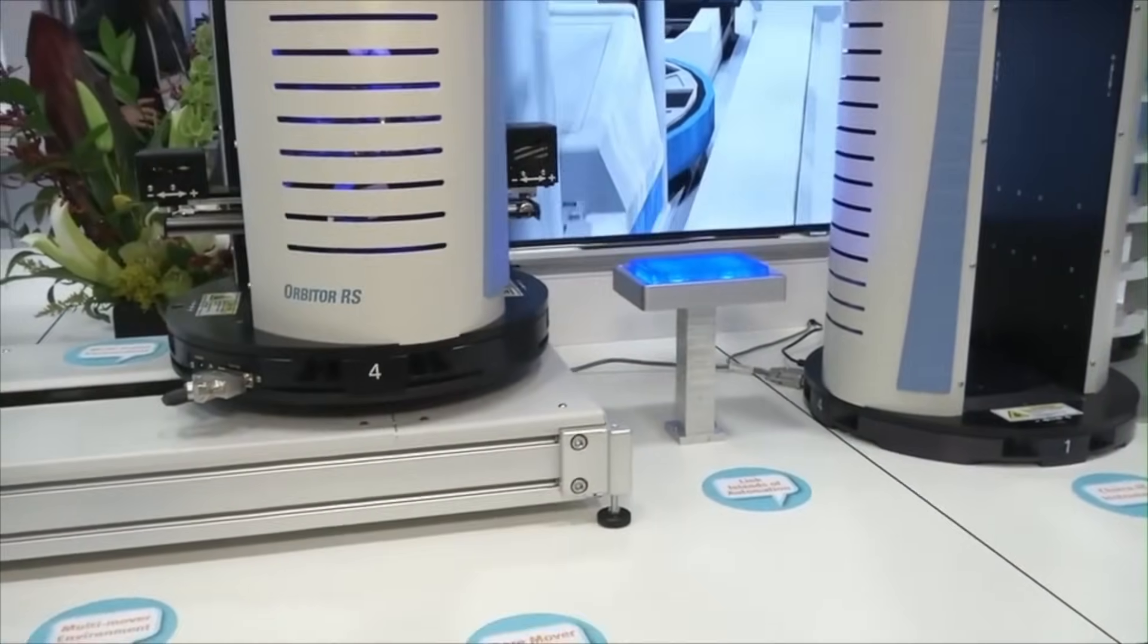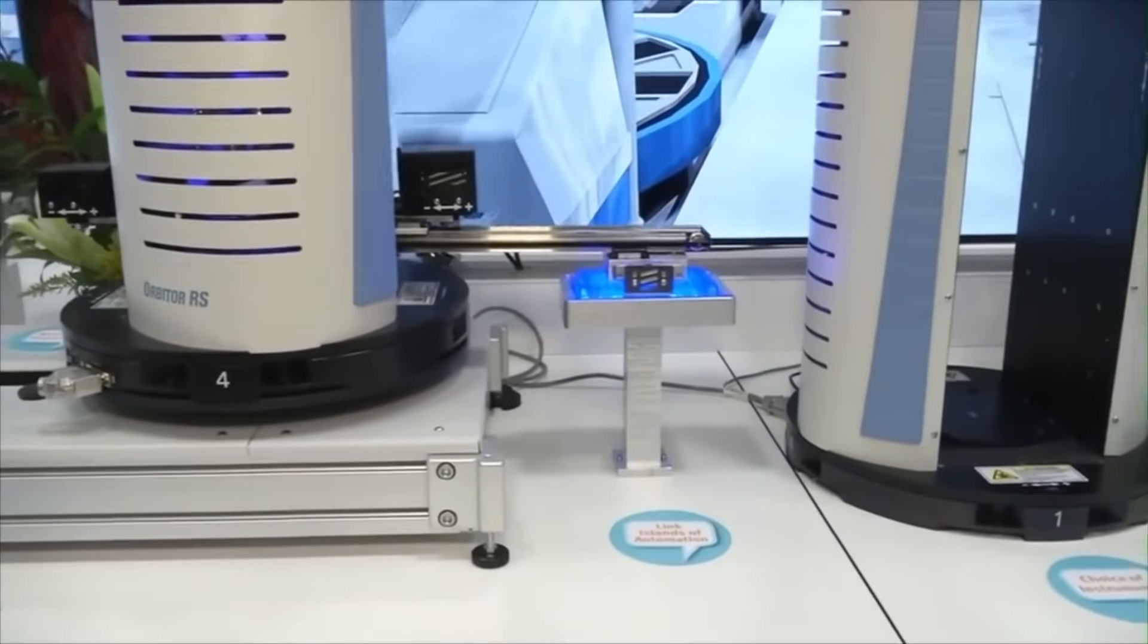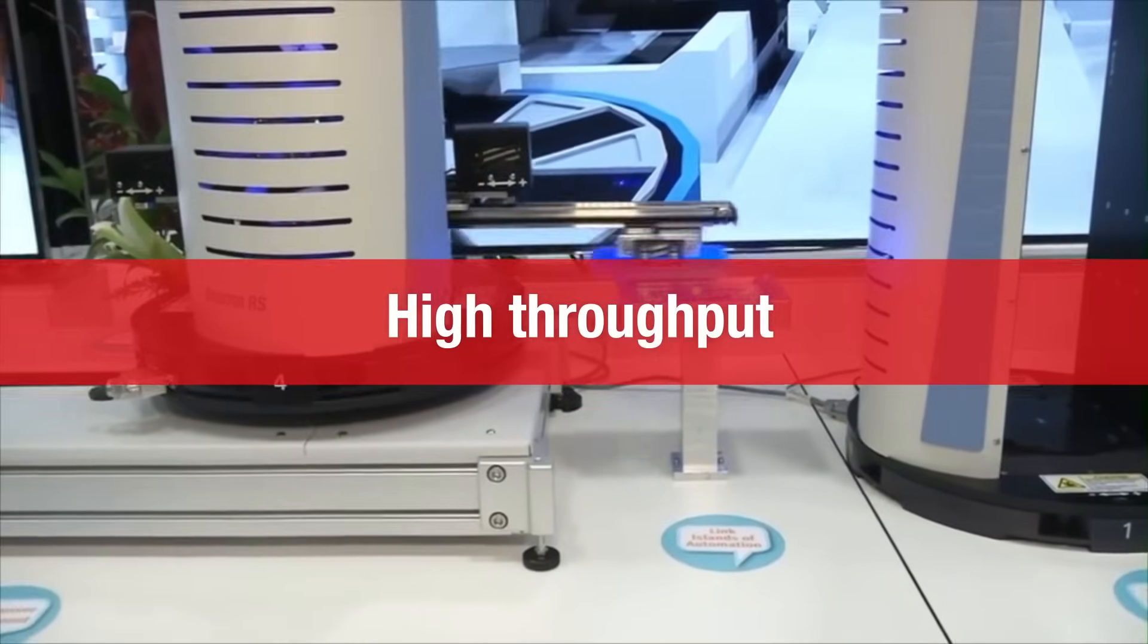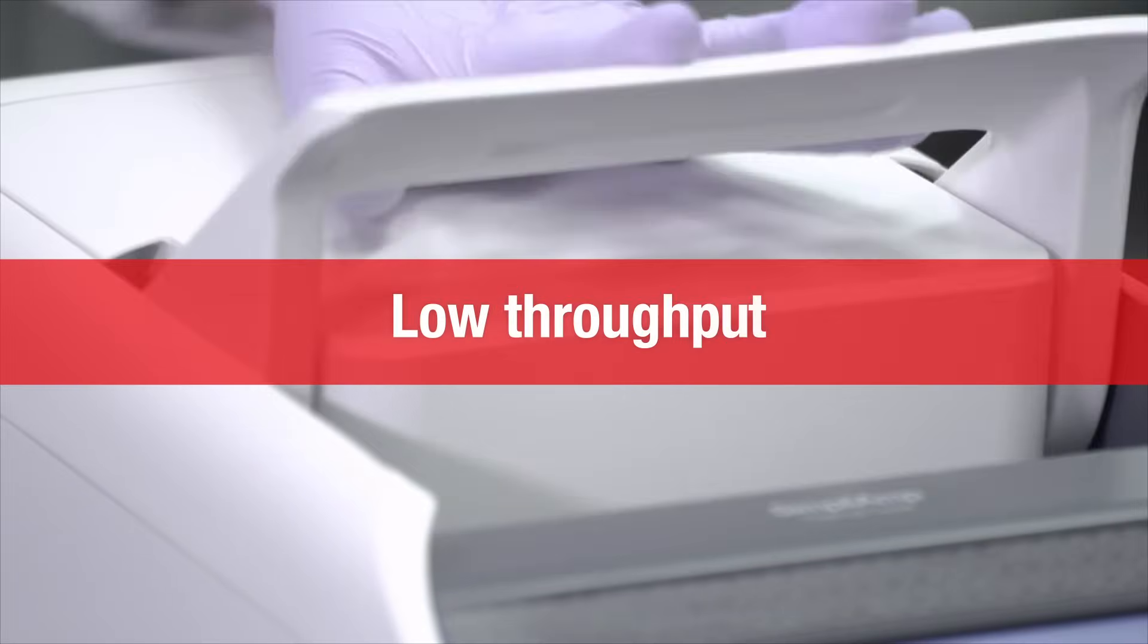Do you need to seamlessly pivot between 96-well robotic system-compatible plates in high-throughput applications and an 8-tube strip in a low-throughput experiment?